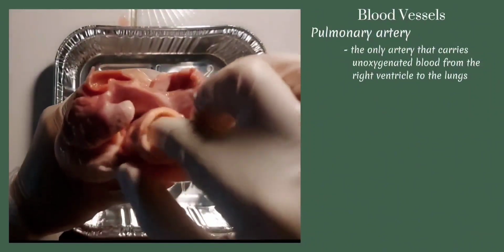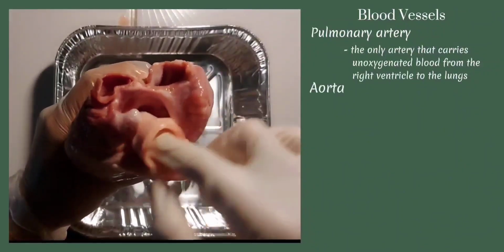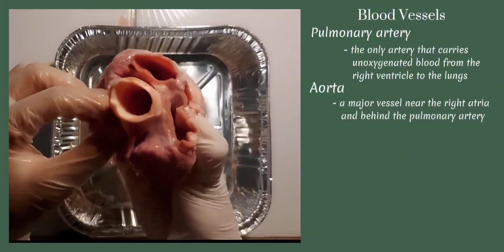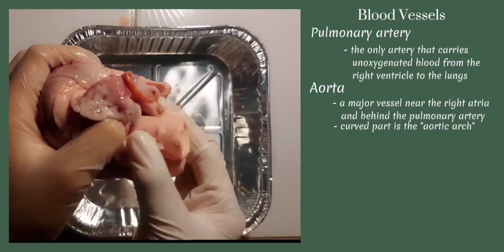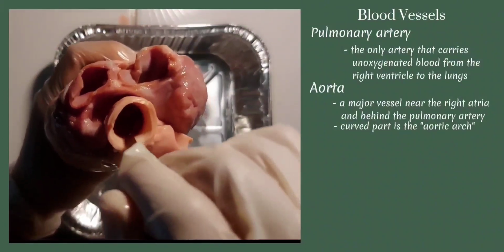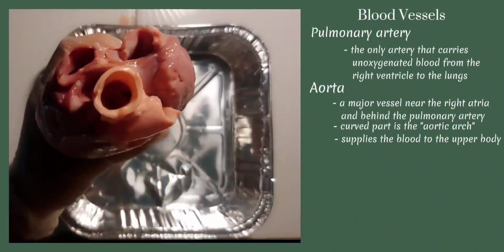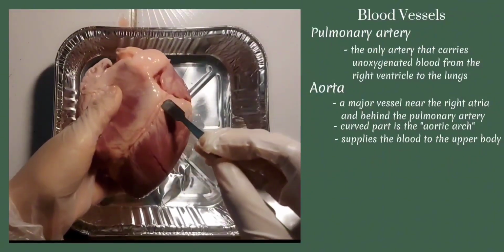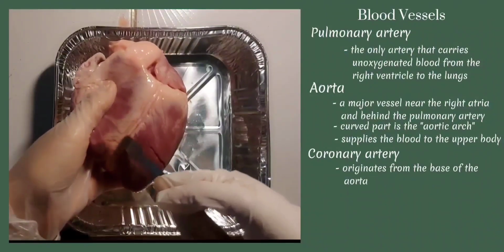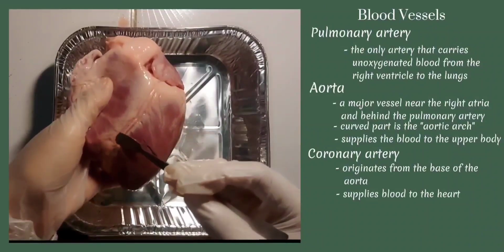And then, behind the pulmonary artery is the aorta. It is a major vessel near the right atria and just behind the pulmonary artery, and the curved part of this is known as the aortic arch. And this supplies the blood to the upper body. These long branches are called the coronary artery. This originates from the base of the aorta and this supplies blood to the heart muscle.